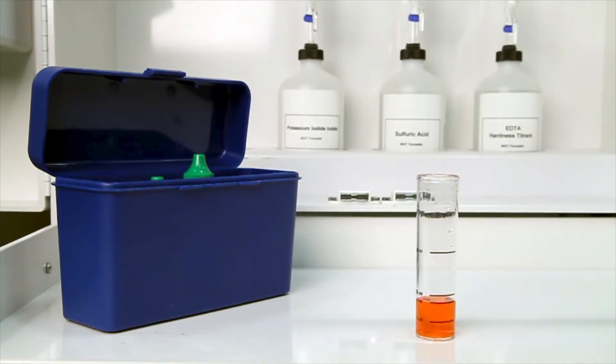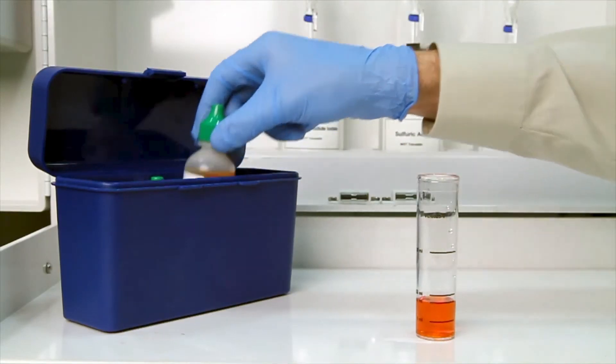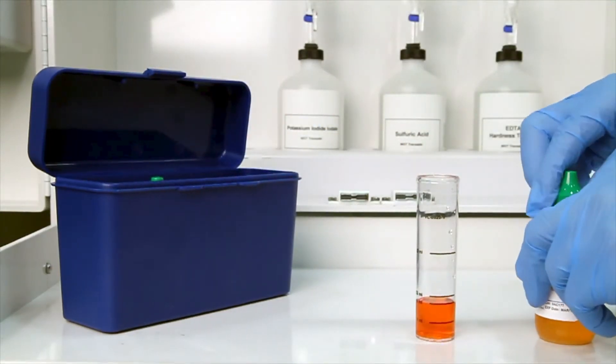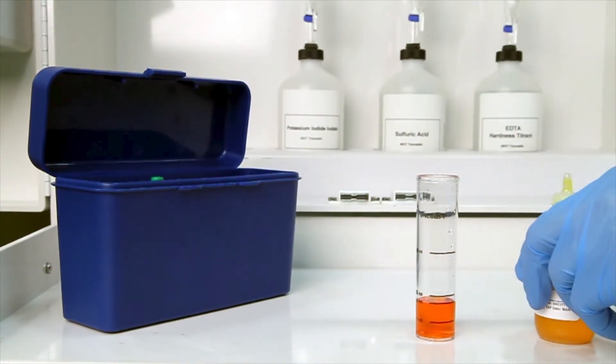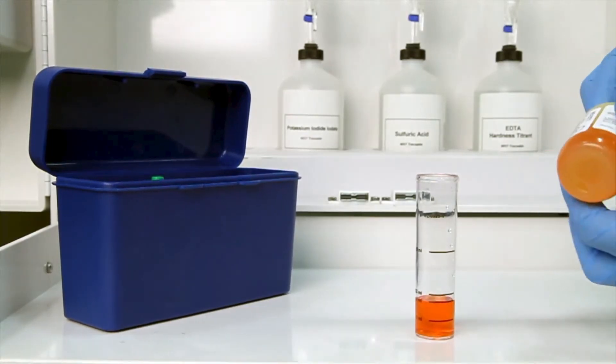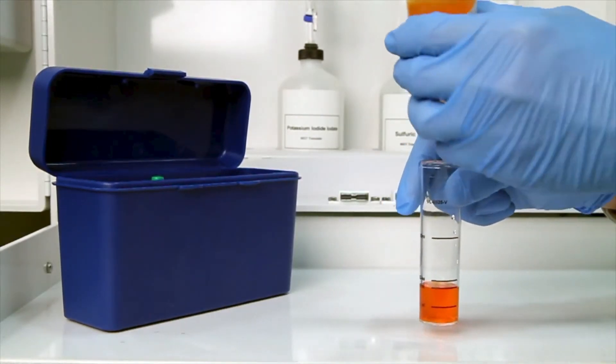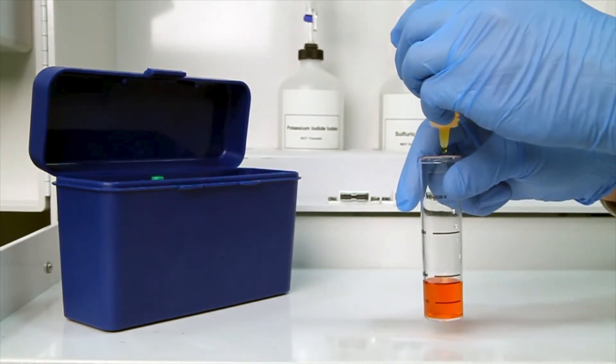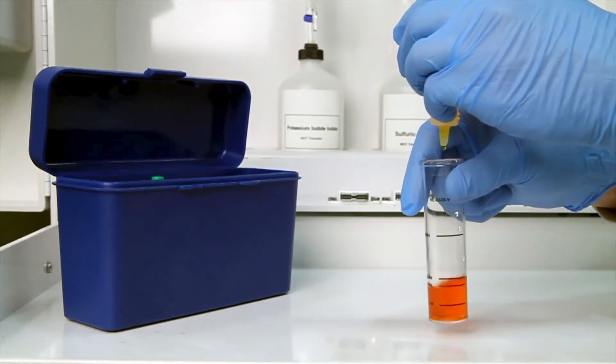The next step is to perform the titration using ceric sulfate 0.0791 normal. Each bottle of titrant is labeled with the equivalency and sample size it was manufactured for. It's important to make sure you have the proper titrant and the proper sample size for this titration.